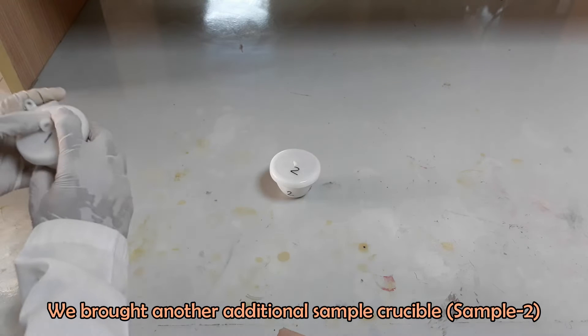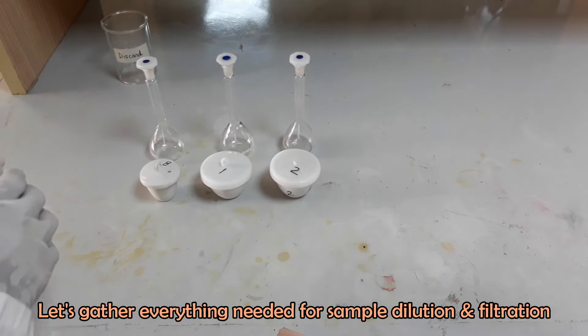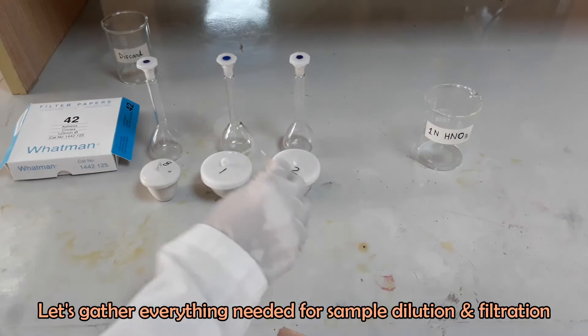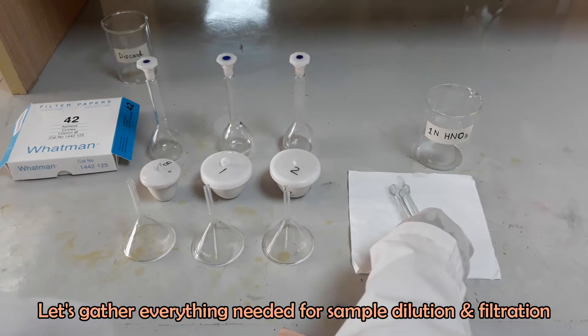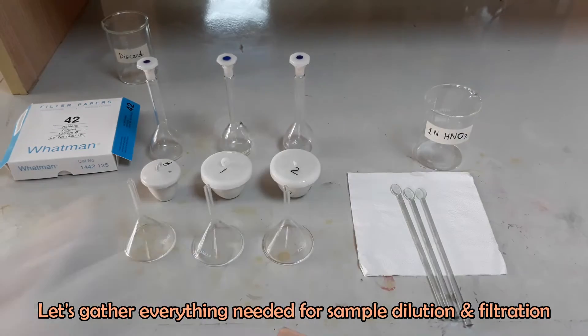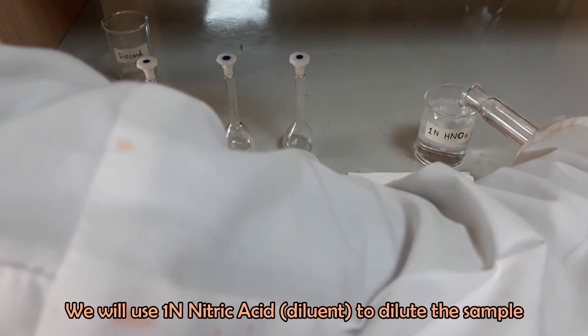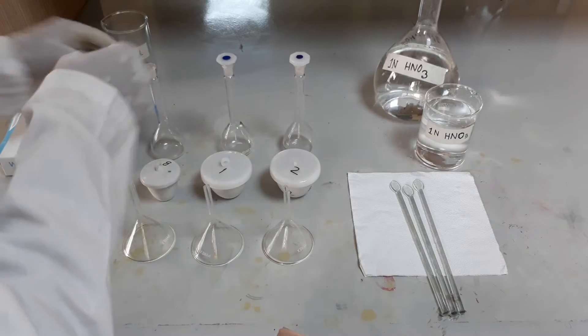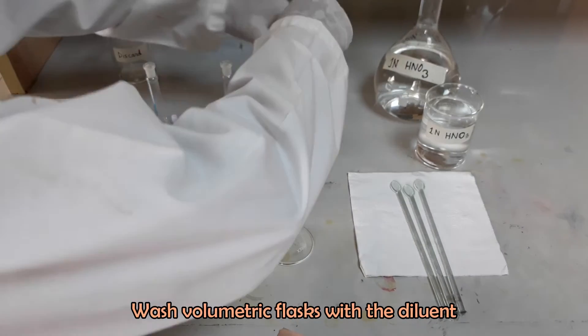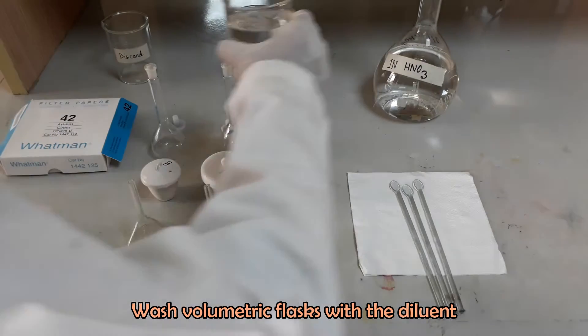We brought another additional ash sample along with the two crucibles. Let's gather everything needed for sample dilution and filtration. We will use one normal nitric acid as diluent to dilute the sample. Wash each of the volumetric flasks with the diluent.